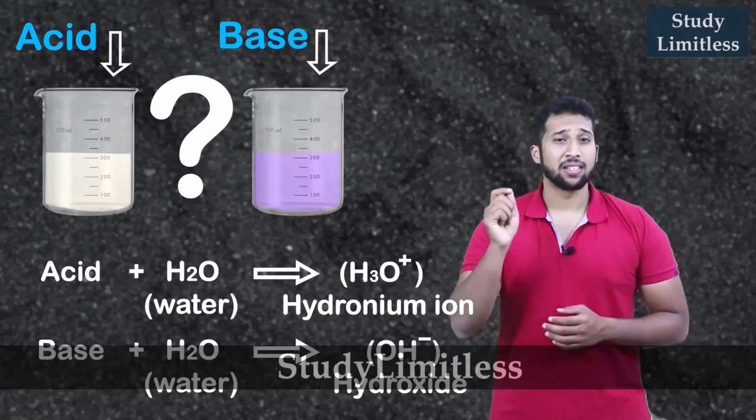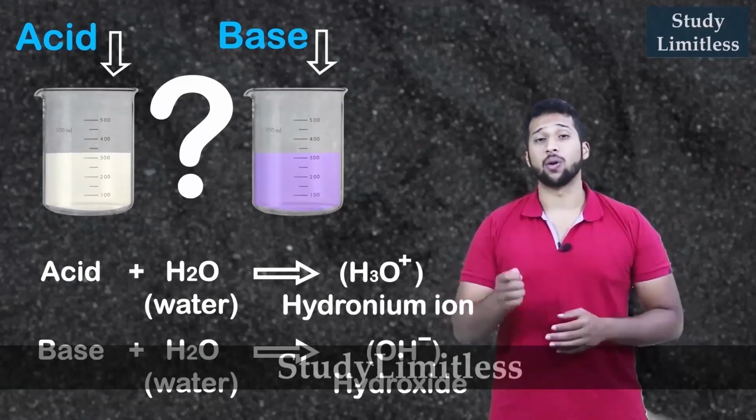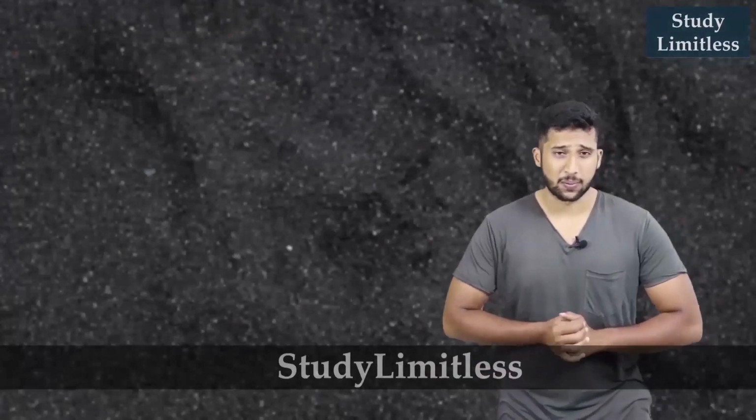Now base, was it the right word? No. The right word was an alkali. The bases which can dissolve in water are called alkalis. Now let's just put this to the test. For this, we are going to set up an experiment.